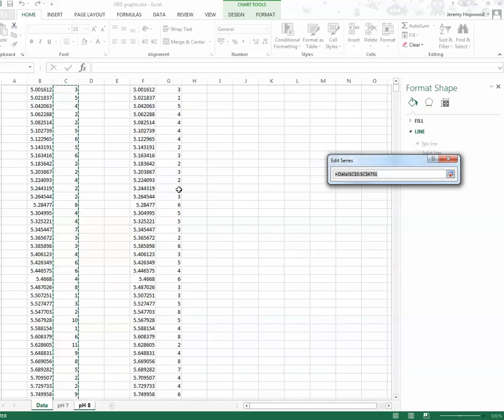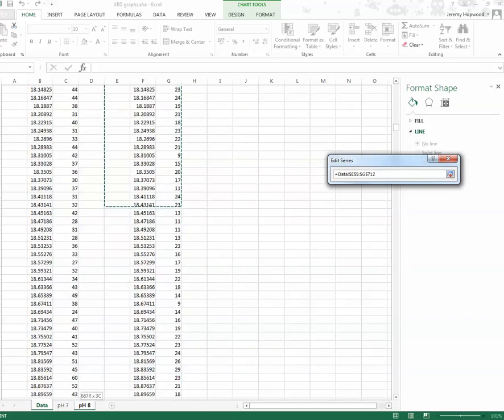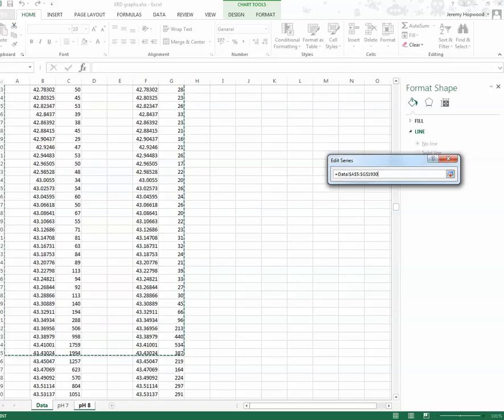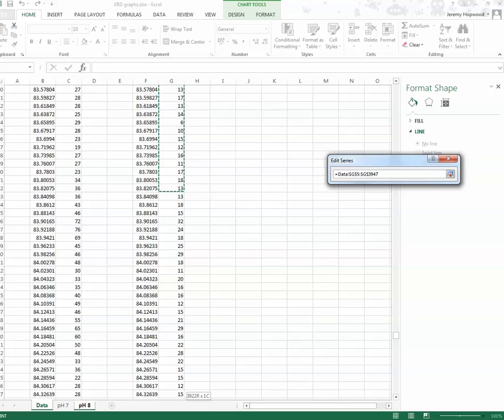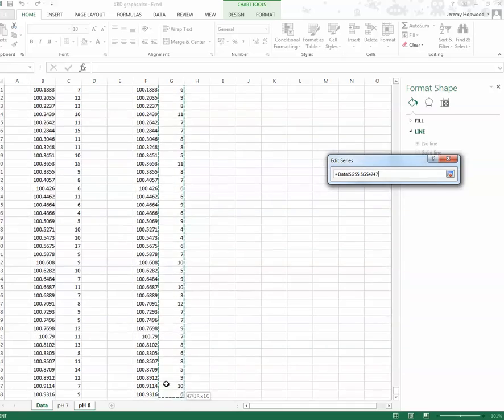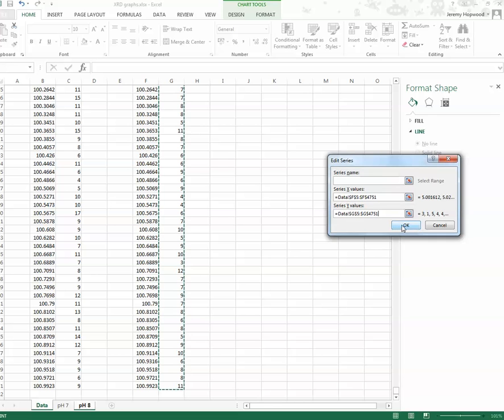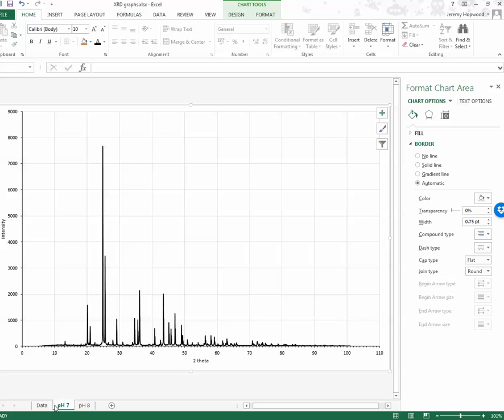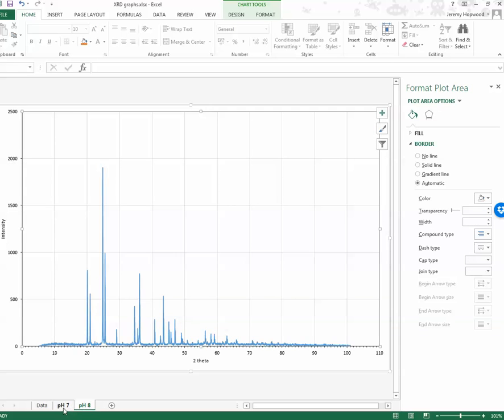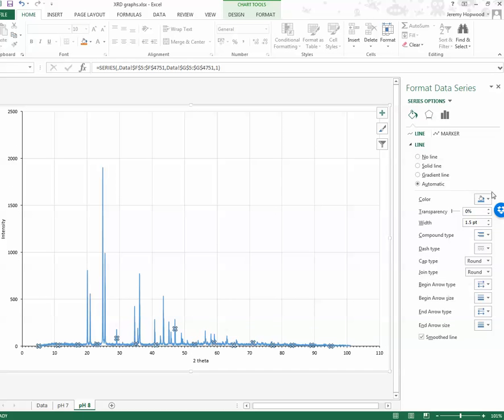and then we've got to do the other axis, which at the moment intensity is there, but we're going to choose the intensity on this side, and we drag that down to the bottom. Oops, not doing very well. There we go, right down to the bottom. And go OK. Say OK again, and if you look here, this is for pH 7, that's for pH 8. Actually, they look quite similar. You need to change this so it's black and white, so it's like the other one. So yes, and there we go.